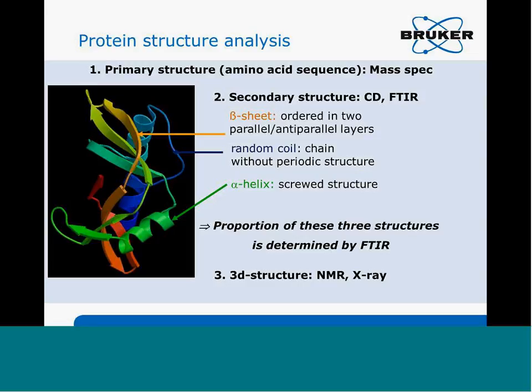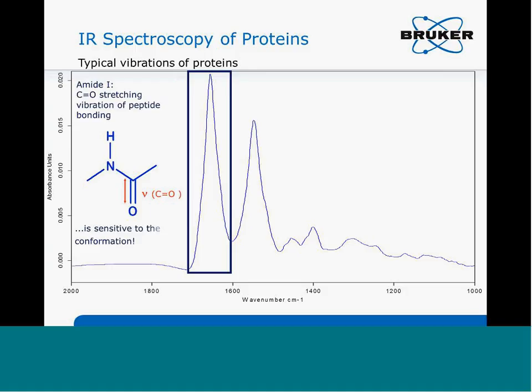Tertiary structure is a more complex arrangement of segments in the proteins, identified from NMR and X-ray. But this time we will discuss only the application for secondary structure.